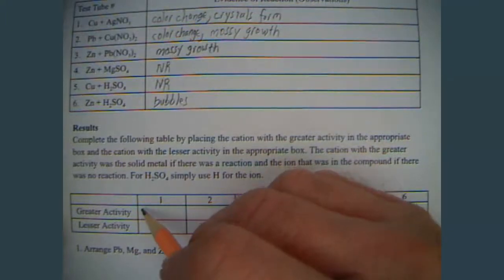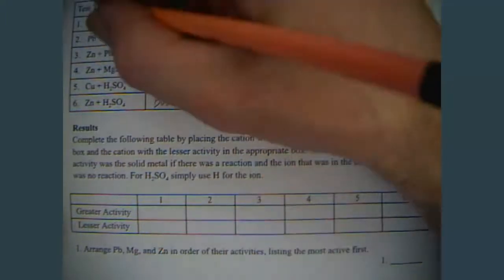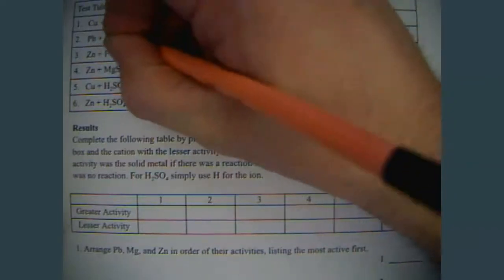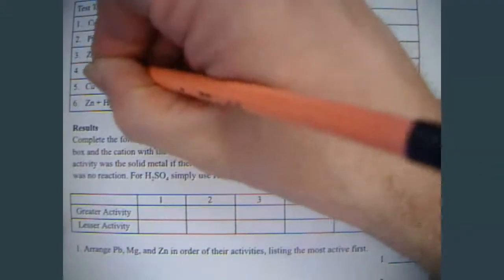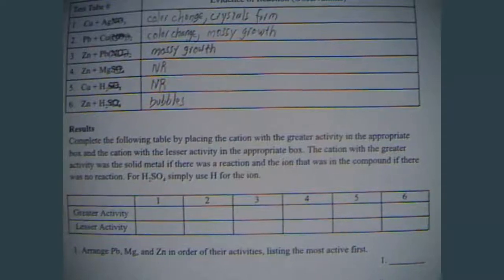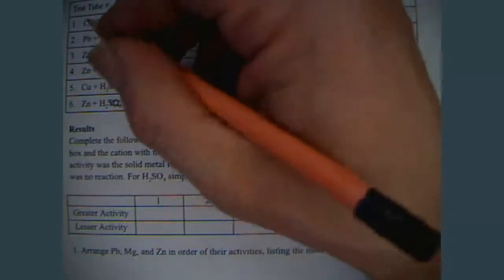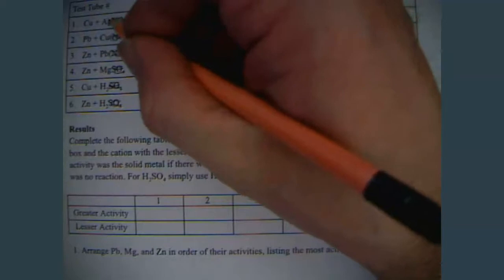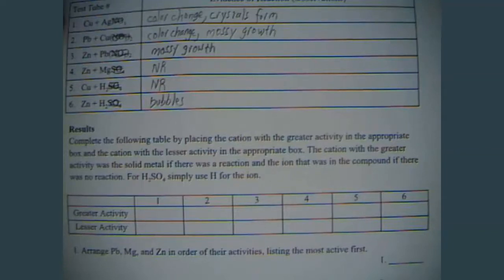Now, how we fill out the table down here is we're only comparing the metals and hydrogen. So, we ignore these nitrates. That was just to get it into solution, so that way we had ions in our solution. And, it's not H2. It's just going to be H positive. And, if there was a reaction, it means that the metal was more powerful than this metal and it was able to kick it out. Again, you can watch my video about different reaction types and single replacement reactions on YouTube on Kicked Up Chemistry.